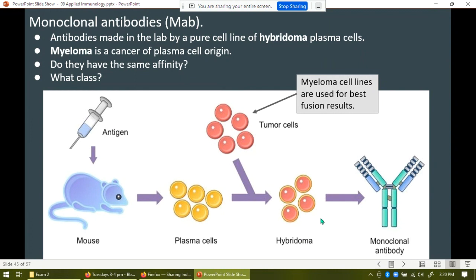This is actually done in these giant bioreactors that are like 1,000 gallons large. So I don't know if you ever played a video game and you saw those giant tanks. It looks something like that, but it's just literally like billions of hybridoma cells inside this huge vat. And they just change the media every 3 days to every 7 days, and those cells are pretty good.